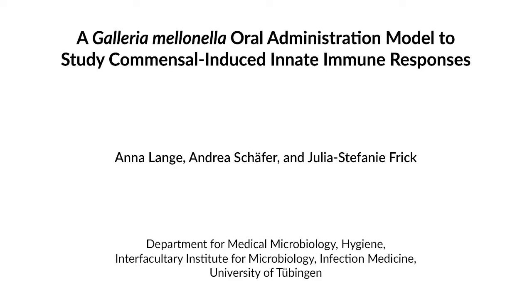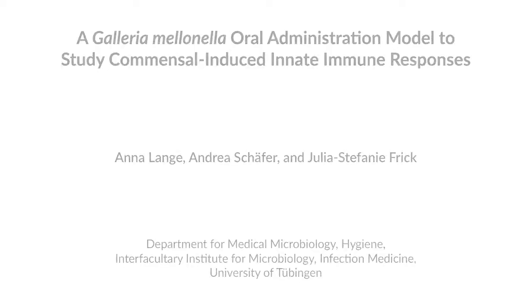Our protocol expands the use of G. mellonella from a systemic infection model to a model that allows bacterial administration via the natural oral route. G. mellonella is a suitable replacement model for rodents in analyzing different hallmarks of innate microbe-host interactions, as the larvae can be used for human pathogenic bacteria.